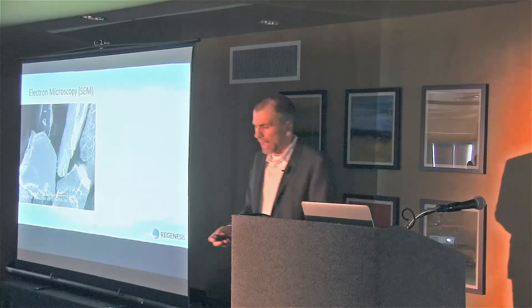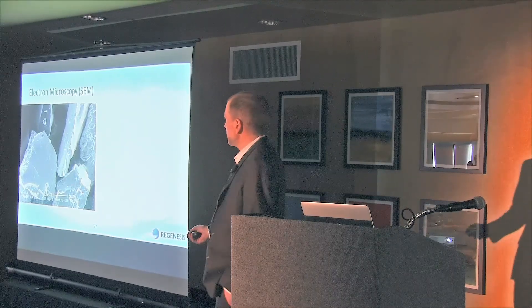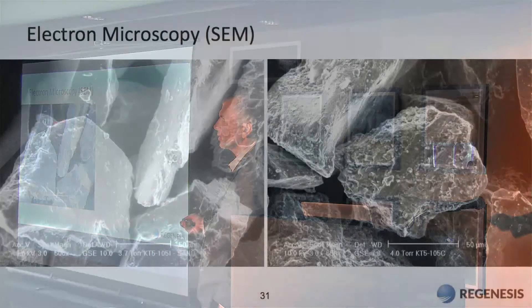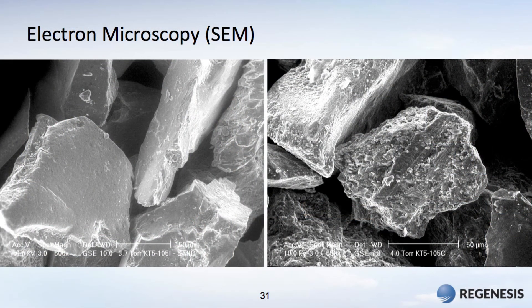The picture on the left is a clean sand that we sent out of the lab. We had a field sand that we sieved and cleaned up and got rid of most of the fines. You won't be able to see the scale bar, but it's about a fifth of the width of the picture and it's 50 microns. So these larger boulders are 50 to 100 micron sand grains, maybe 20 micron in the smaller dimensions.